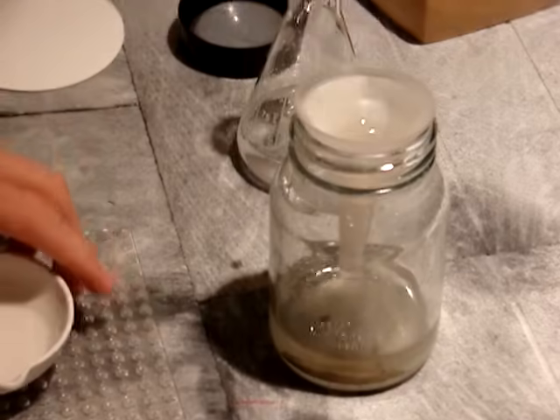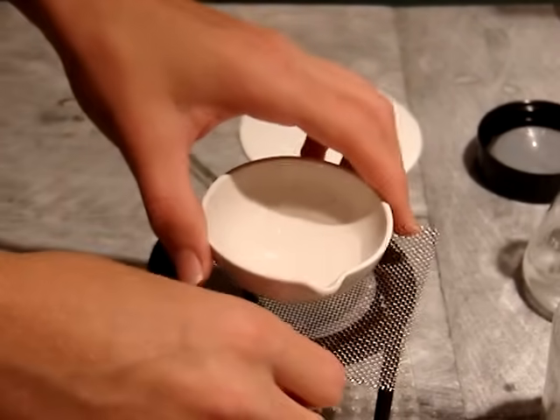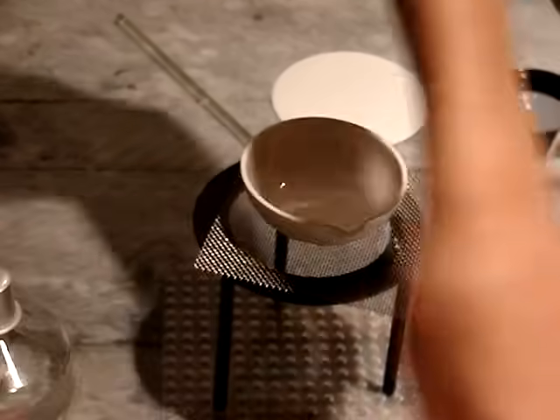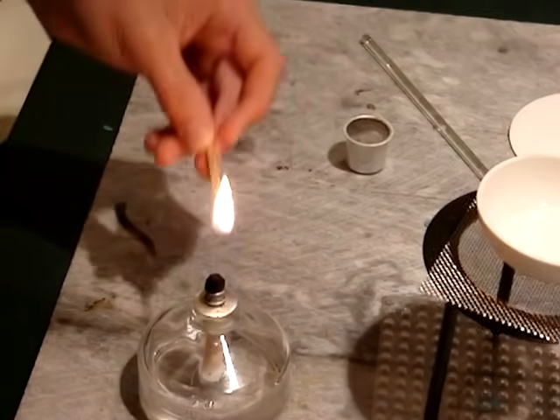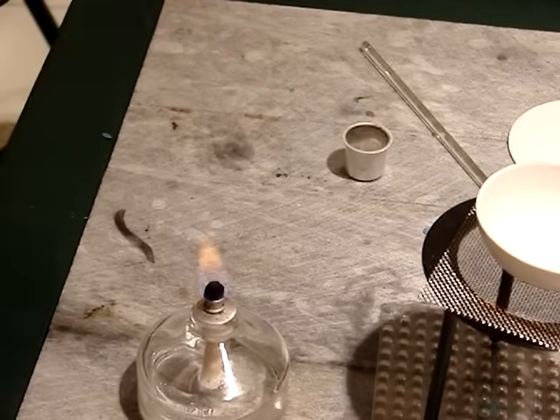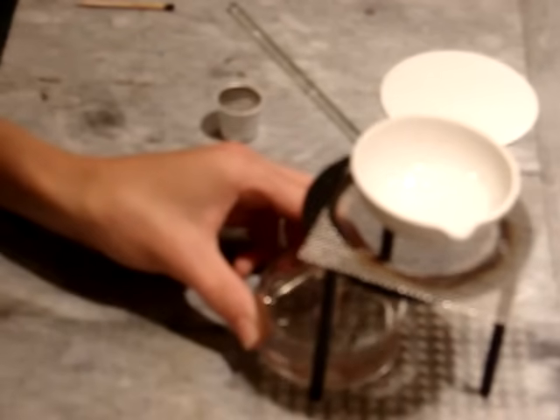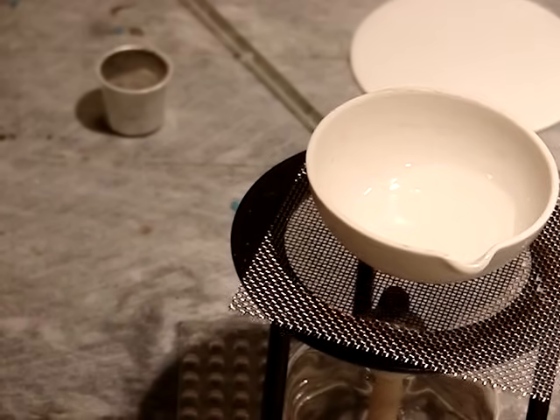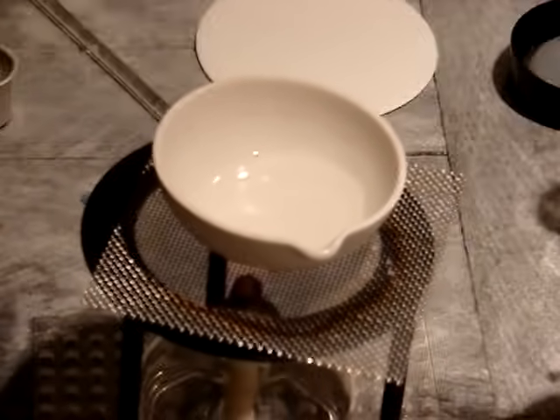Okay, and now we're going to set this over my tripod stand with a wire mesh that distributes heat. And I have this alcohol burner here and a match. And what I do with it is I uncap it and I light the match. Fire! Light the alcohol burner. Make sure the match is out. And carefully slide the alcohol burner under the dish. And sooner or later, salt is going to begin to form at the edges because the water is evaporating.